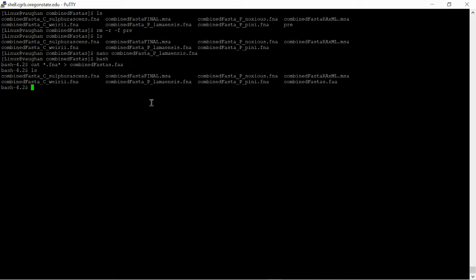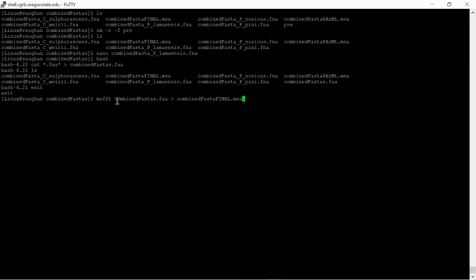I'll give you a visual of what that looks like after this. But for that, for most everyone, your command is going to look something like this with just MAFFT, then your combinedFASTA files, and then to the output.